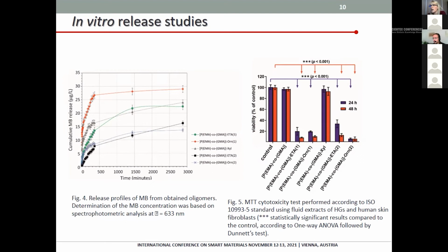The study was carried out at 37 degrees Celsius, simulating the average body temperature. Methylene blue was used as a model compound to study the release from the gel matrix due to its hydrophilic properties and the easy determination by UV-vis spectrophotometric methods. The results showed that the release of methylene blue loaded into the hydrogel is highest and fastest during the first 6 hours. After this time, the release is reduced until it reaches equilibrium with the solution, which was observed during 48 hours of the experiment.